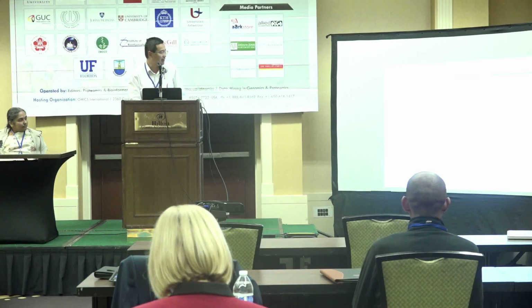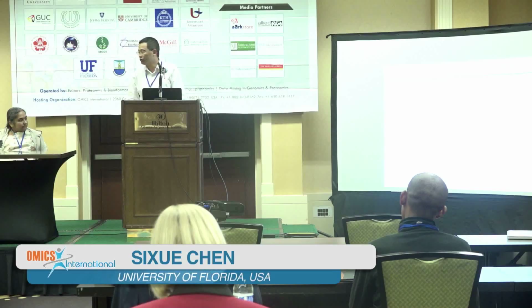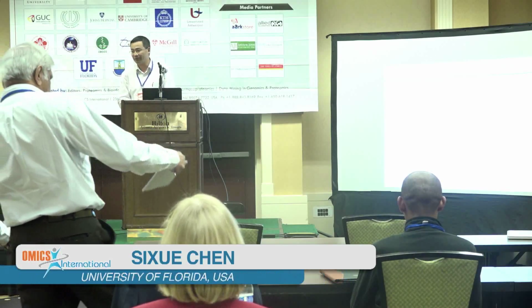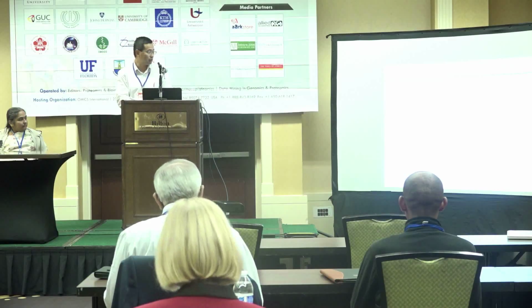And also top down. As you know, a lot of times we don't capture the modifications. Tong has been working on phosphorylation, the phosphoproteome. We miss a lot of phosphorylation sites, some of them so low abundant that even when we do affinity-based enrichment, we still don't capture them.